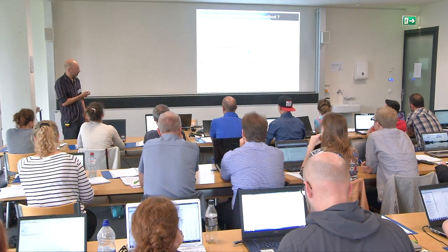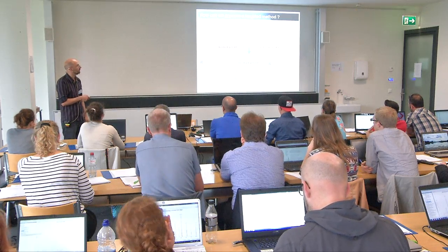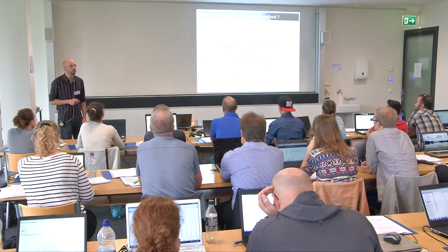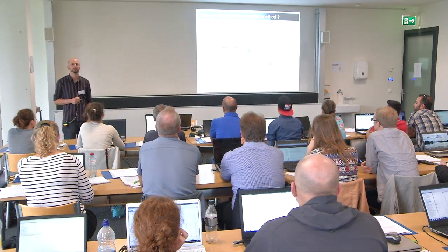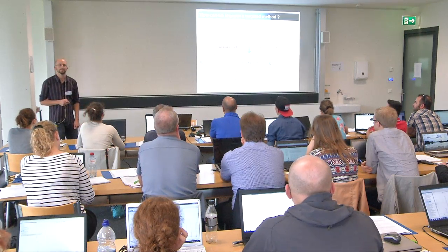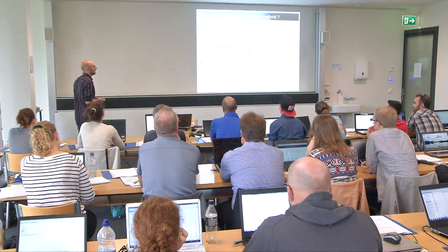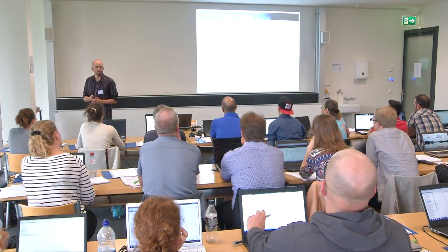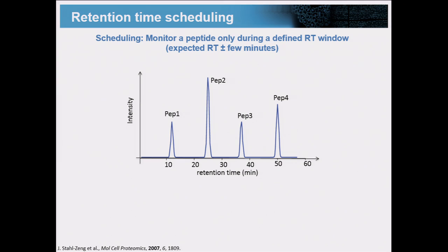So how can we improve the interplay between these different parameters? What would be at least one way that you've already heard about? So one way would be scheduling. This is what Tina very briefly mentioned, so I will explain it again.